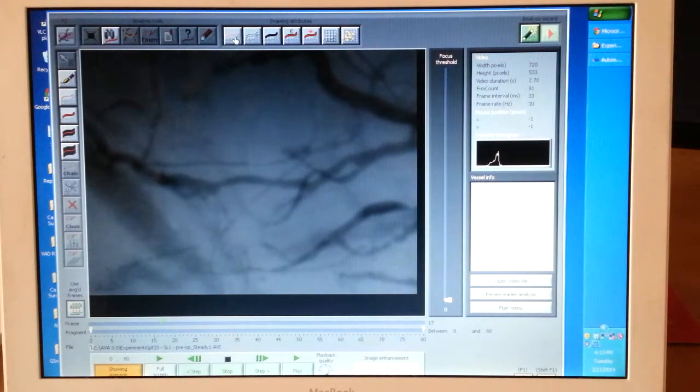Okay, so once we've created this smooth image, the next step is basically drawing all the vessels. Okay, so first you want to turn on these little indicators here to actually display the vessels. This is Show Center Line and Show the Vessel Wall. Okay, we want to turn those on. Basically, there are two ways to draw vessels. We can ask the computer to kind of find vessels by itself, or we can draw them manually on our own. Okay, I personally prefer the manual drawing way. I find that when you ask the computer to draw in the vessels, it often has some difficulty, especially in areas where vessels overlap. So I just prefer to do all of it manually.